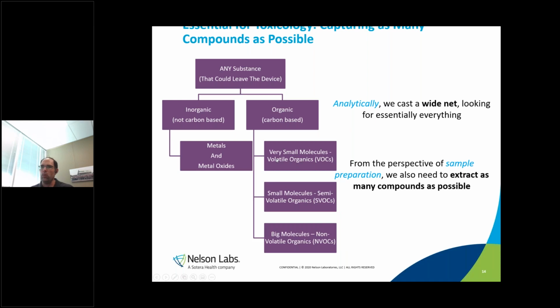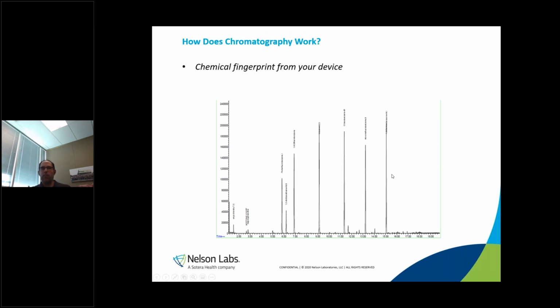So when we don't know what we're looking for, we open up our scans, we try to find everything we can. This is the full-blown extractables and leachables that everybody's dealing with right now in the industry. Those are helpful if the change is really not known or the impact is not known. We may have a risky device, so we may have to go into more of a full-blown extractable leachable profile. But the endpoint of that full-blown is we get identifying peaks.